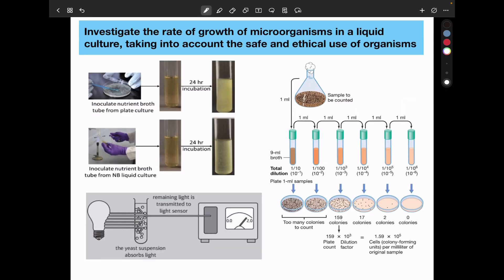I'm going to begin by looking at safety precautions. You need to wear eye protection. Keep the Bunsen flame away from the flammable substances — this includes the ethanol or alcohol used to sterilize the surfaces. You must culture using aseptic techniques like sterile equipment and wear gloves. You need to incubate cultures at temperatures below body temperature to prevent culture of pathogenic bacteria. Disinfect workspaces before and after the experiment, and you should safely destroy cultures by autoclaving at the end of the experiment.